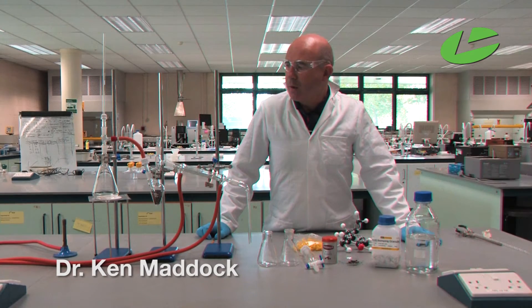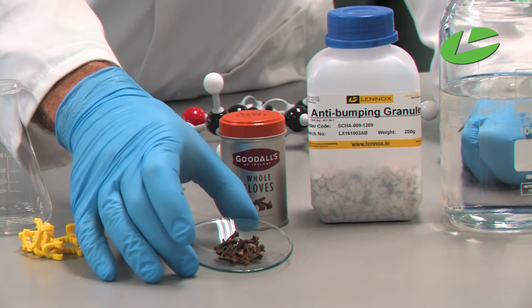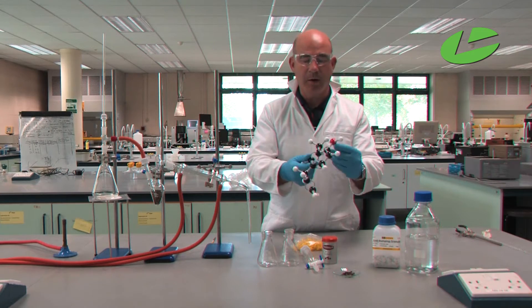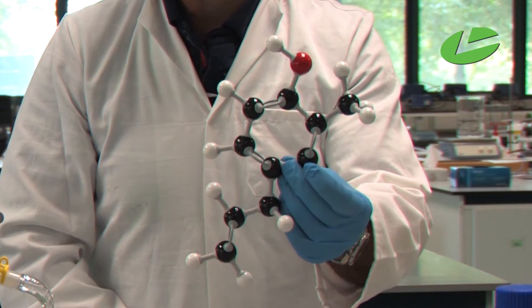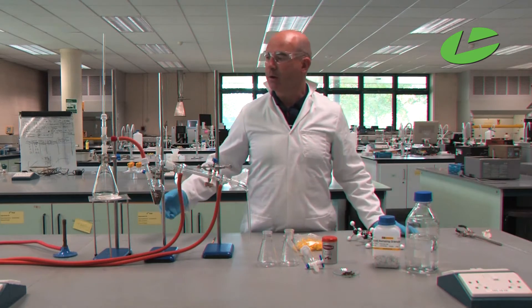In this practical I'm going to be doing the extraction of clove oil from cloves. Here are the cloves I'm going to start off with, and this is the molecular model of eugenol, which is the scientific name for clove oil.